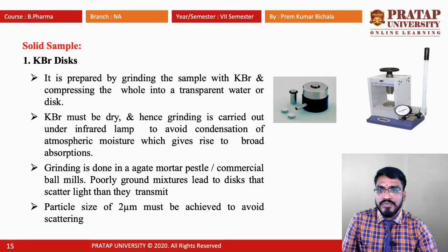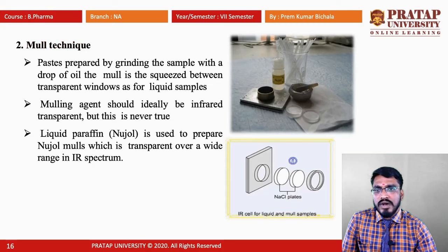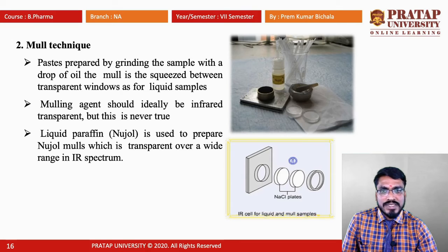The second technique for solid samples is the mull technique. In this technique, pastes are prepared by grinding the sample with a drop of oil, that is, the mull, which is squeezed between transparent windows as for liquid samples. Just go through the first two pictures. There we are using Nujol. Nujol oil is used for the sample preparation, and that comes under the mull technique.